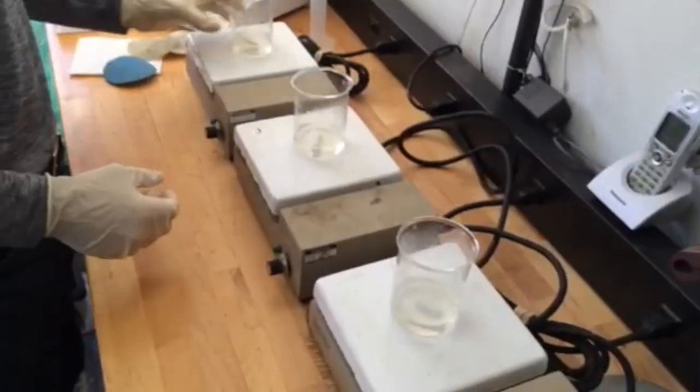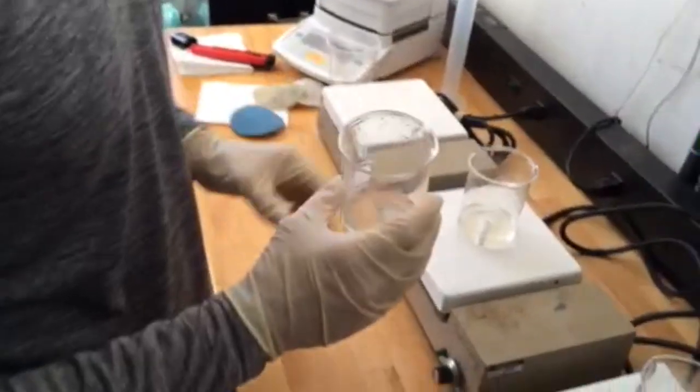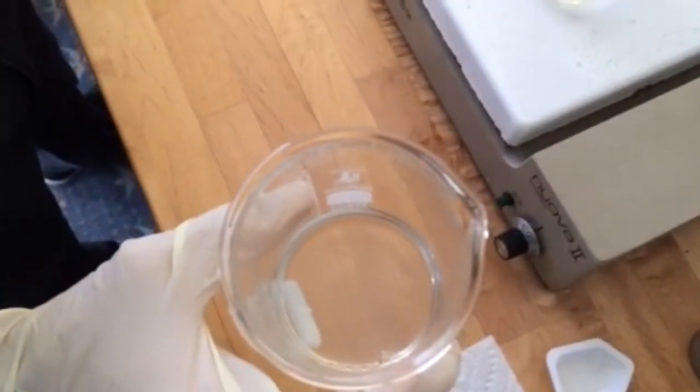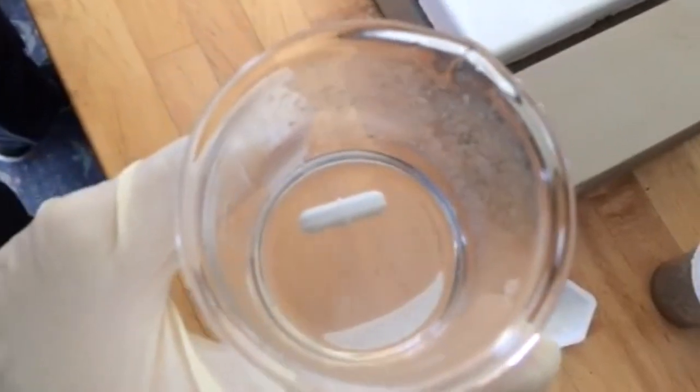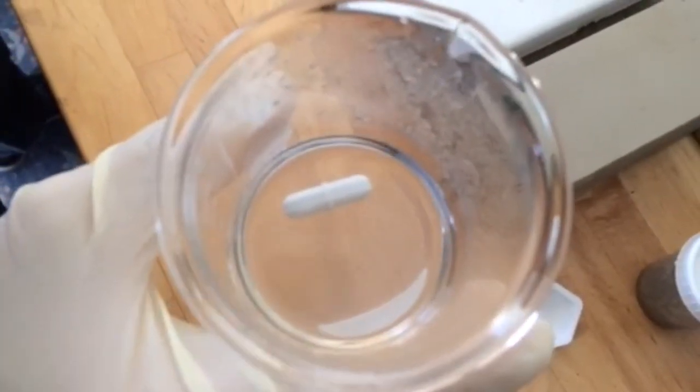Now it's time to review the results. The first sample, the 1 to 1, has completely dissolved the 1 gram of struvite in 15 minutes. We've also taken pH readings, and the pH is up to 2.9, which means we have plenty of product left to treat more struvite. The second sample, the 2 to 1, again has completely dissolved the struvite in 15 minutes. And the third sample also has completely dissolved the struvite.